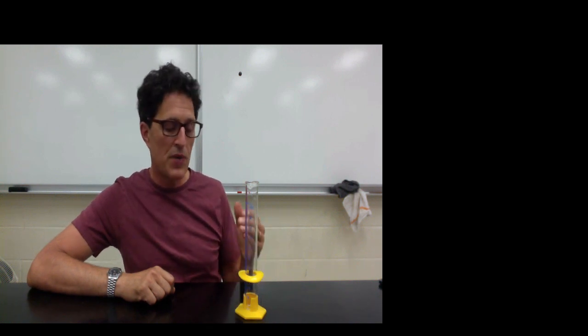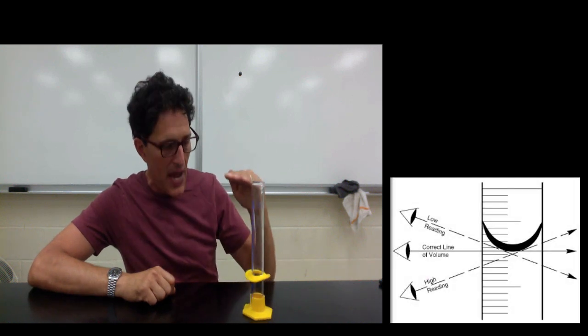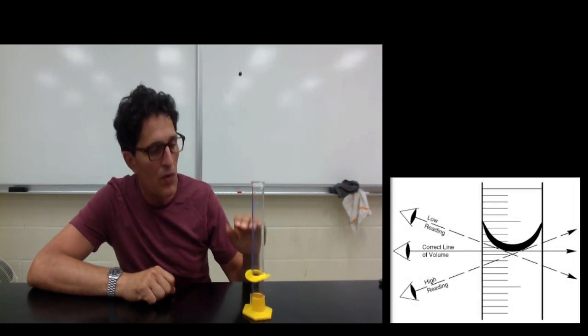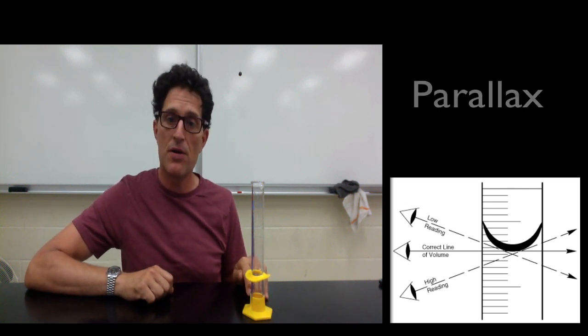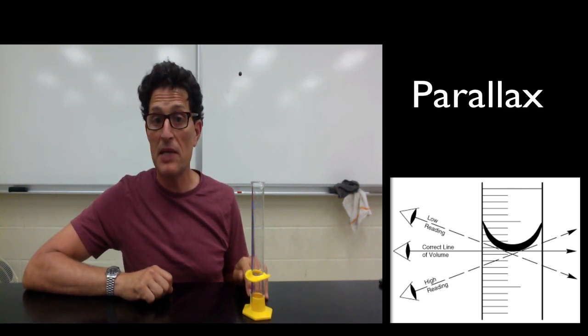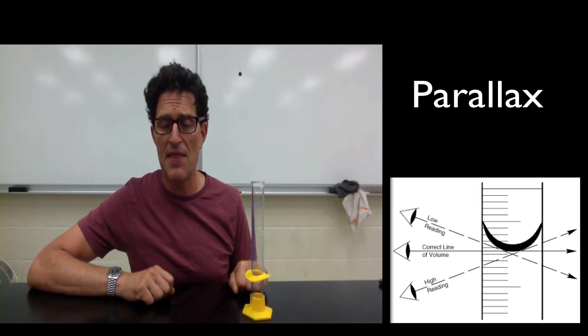Next, you want to make sure that you're reading the volume at eye level which means that you need to move your head down to the volume in the graduated cylinder to avoid something called parallax. And I'm expecting that you'll research parallax and find out what exactly the problem is that it creates.